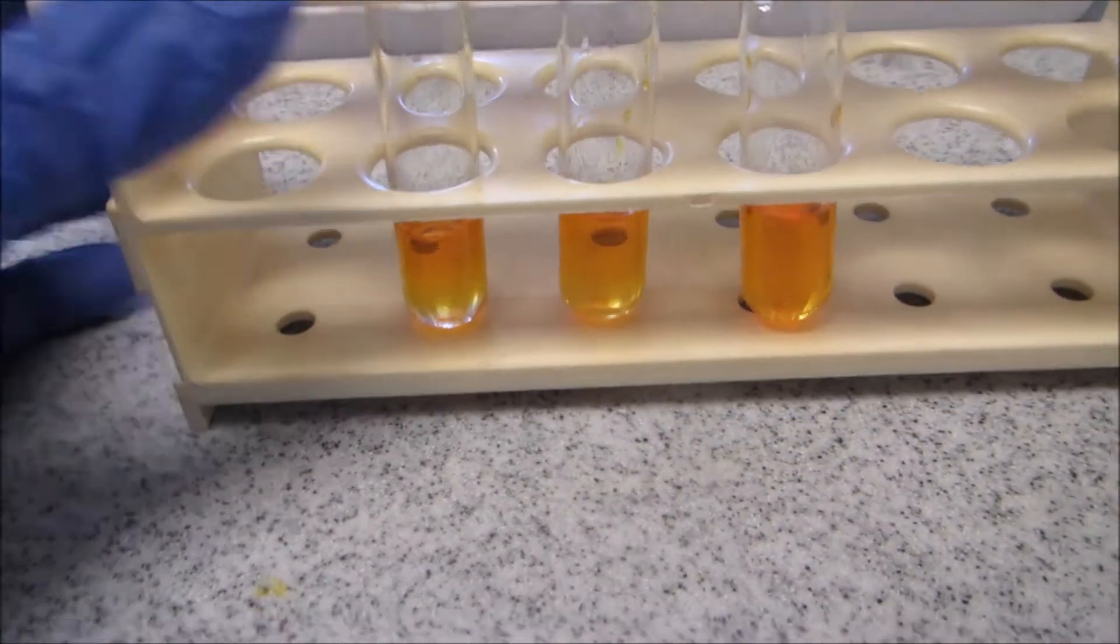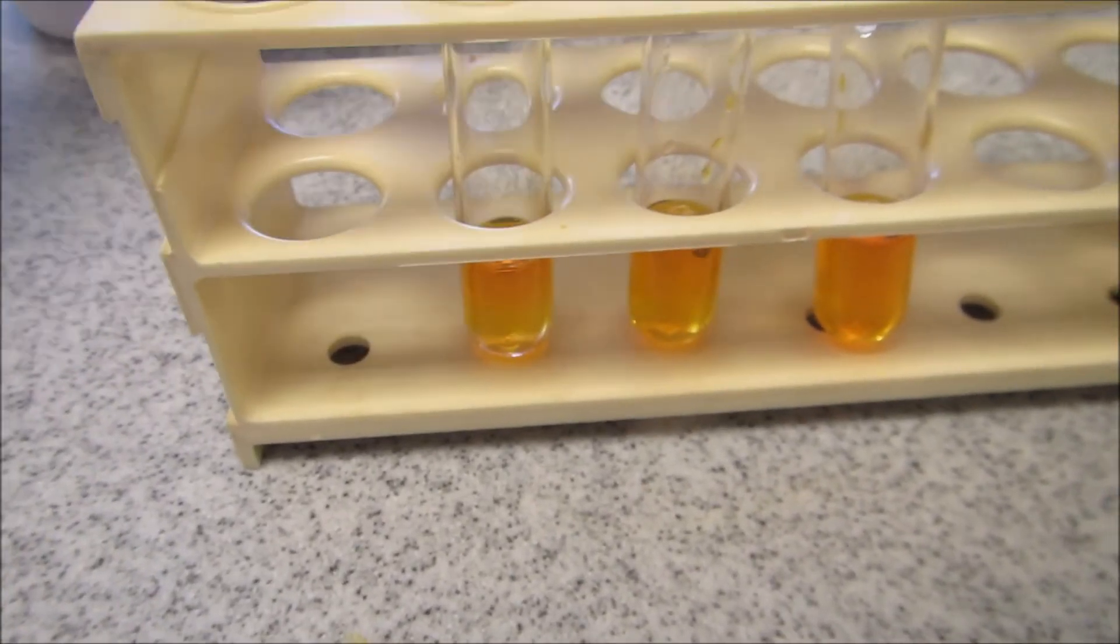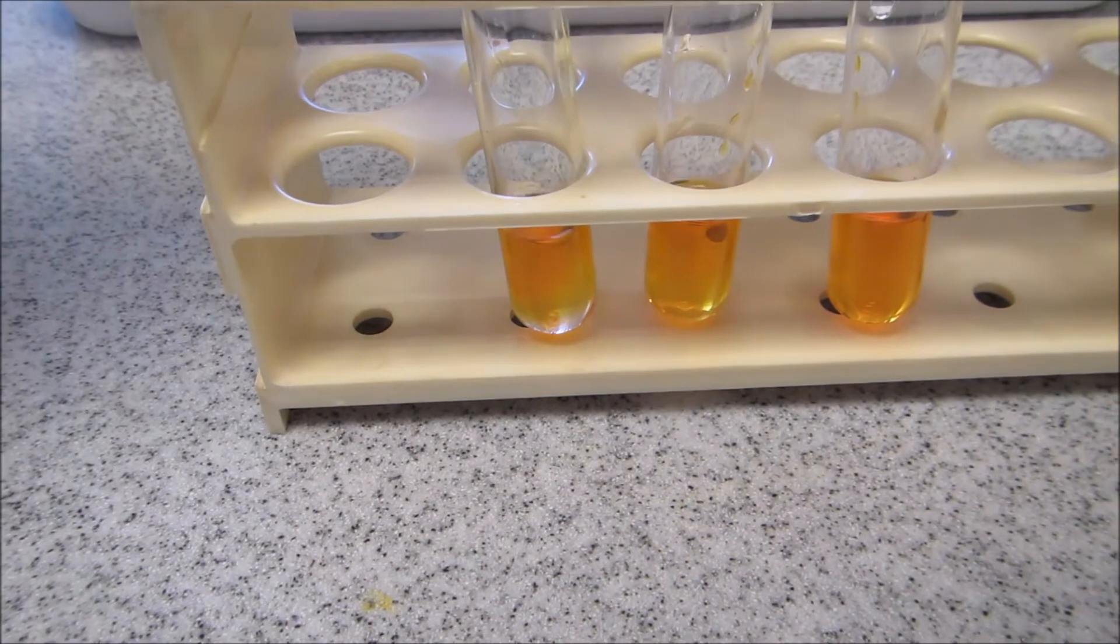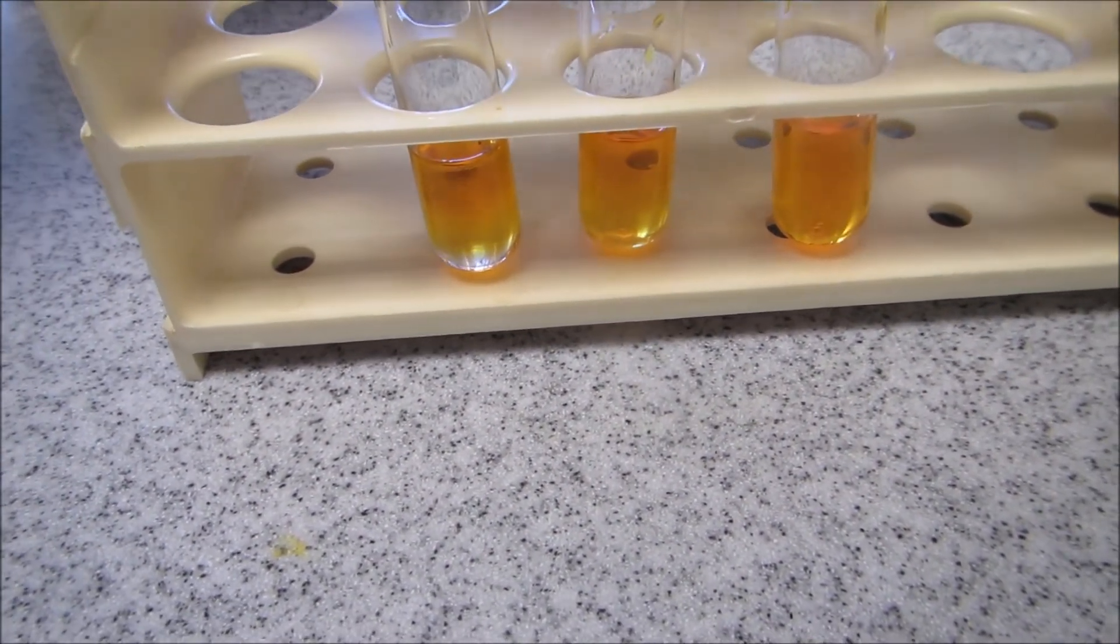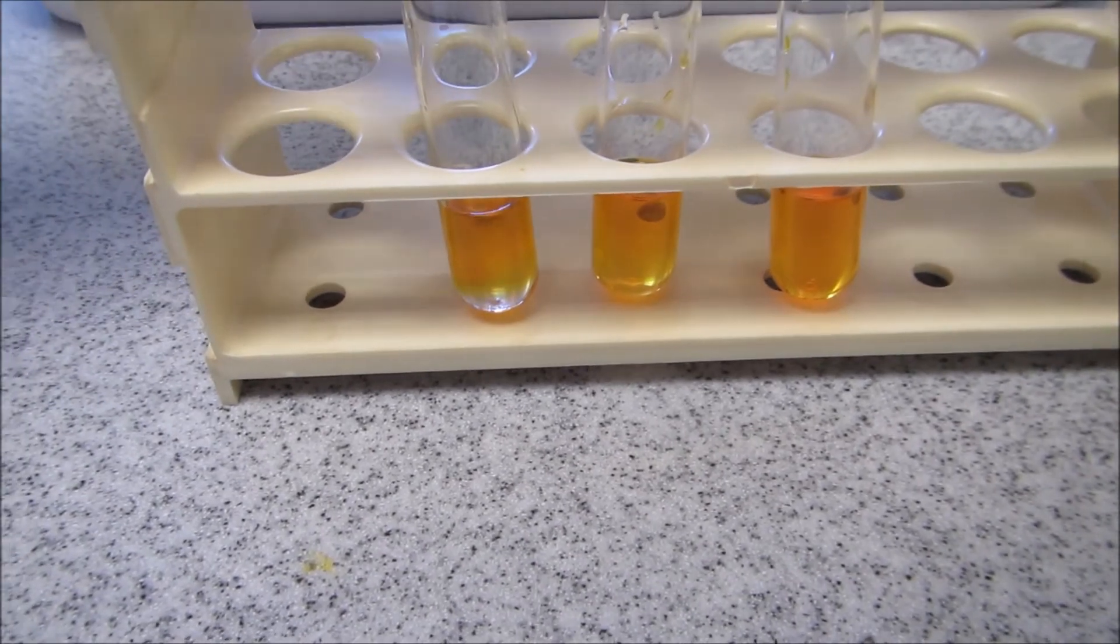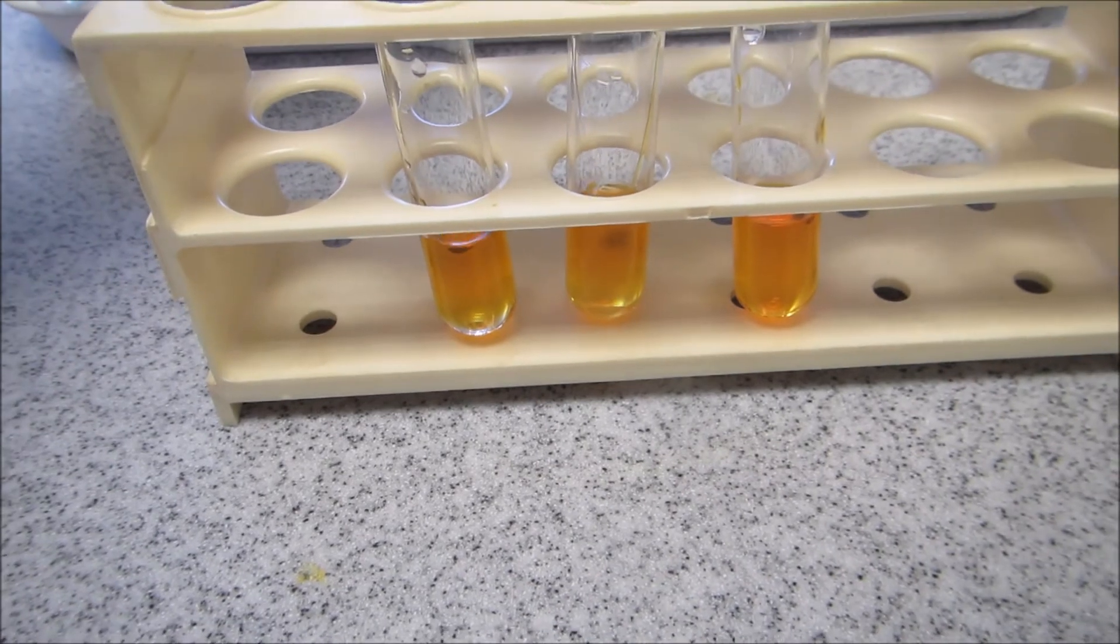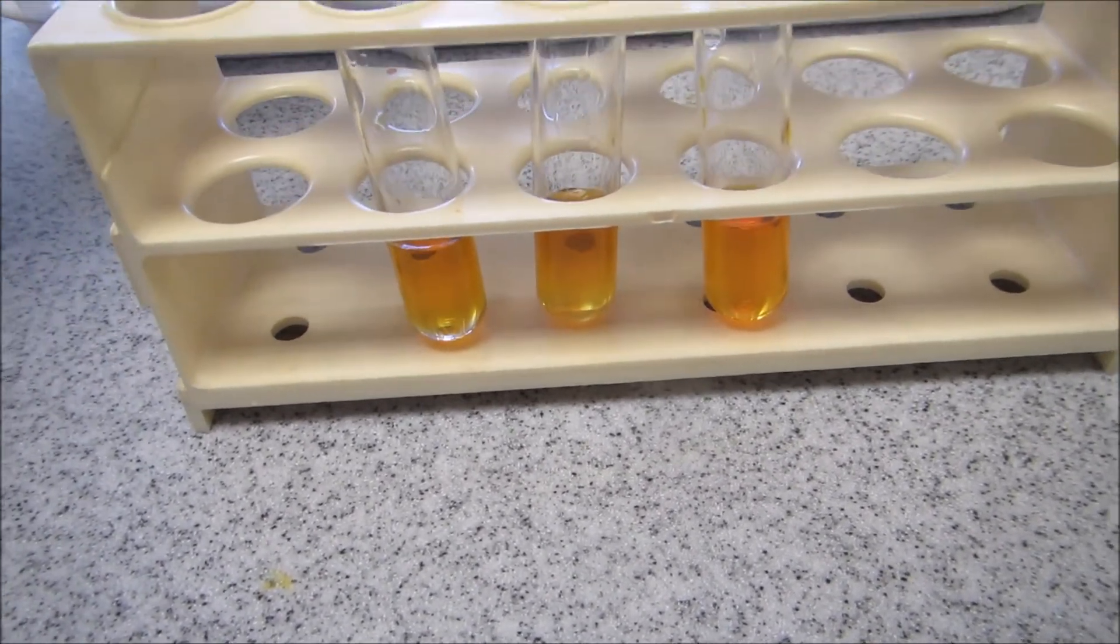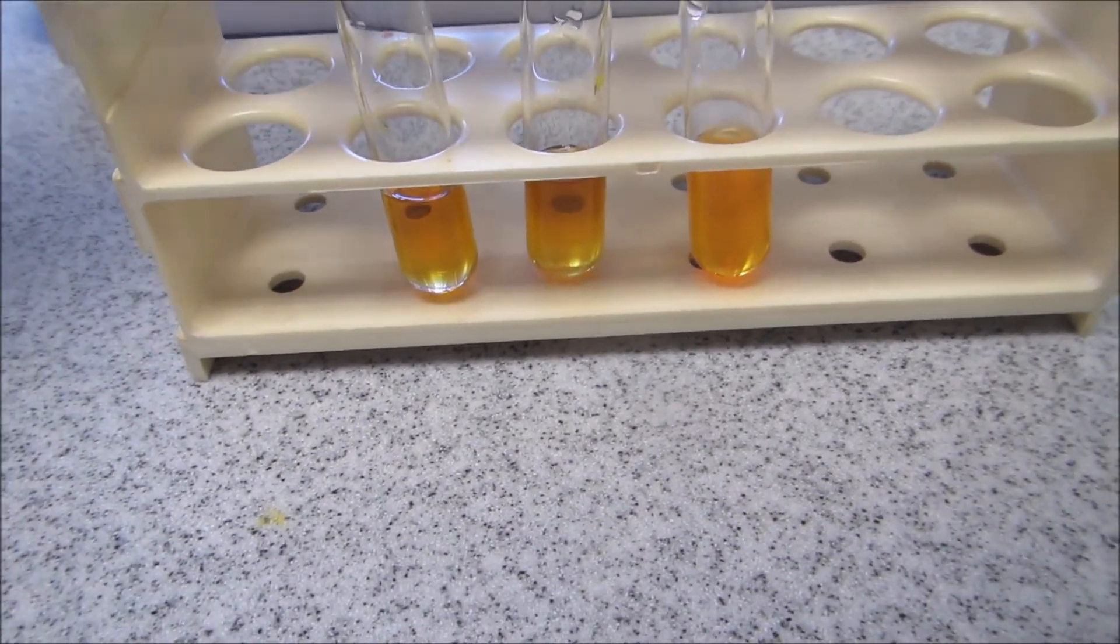I'm going to carry out the potassium dichromate test on the same ones, three, four, and five. So add a bit of three. What do you observe? Add a bit of four. Finally, add a bit of five.